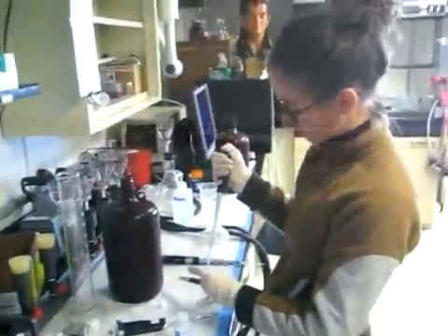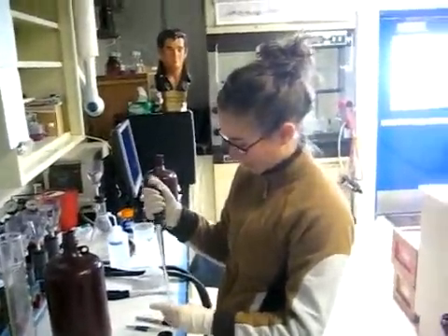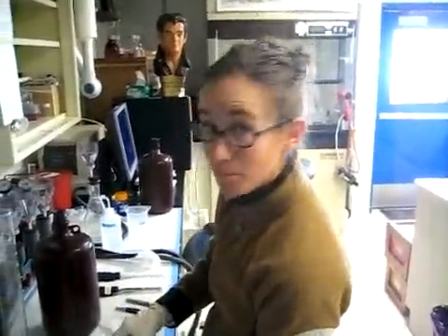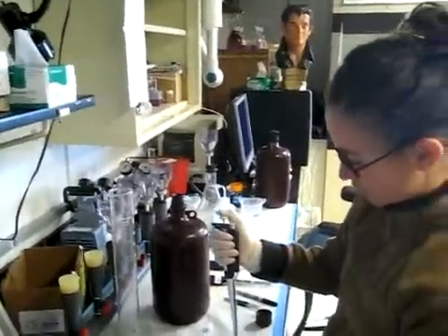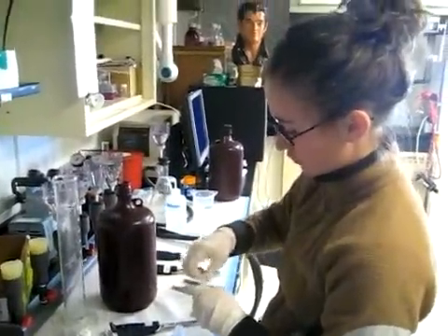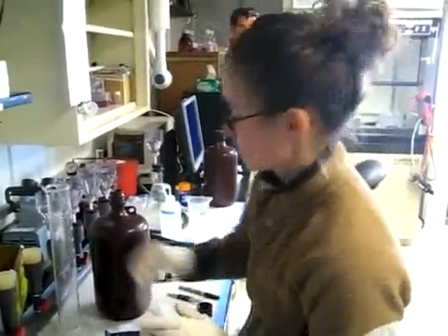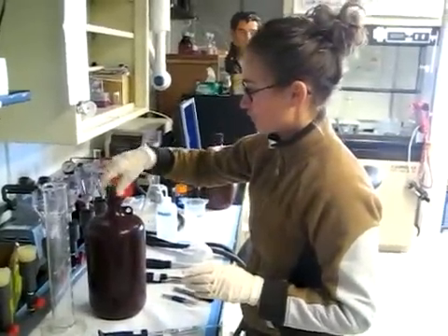Once the samples are collected and brought on shore, Elizabeth is filtering the water. We're filtering about 200 to 400 milliliters of water — maybe 600 milliliters — whenever the filter turns green. The filter will turn green because of phytoplankton that are being stuck on the filter.